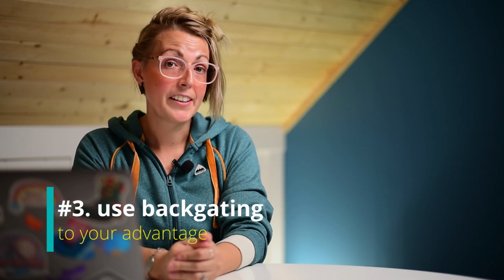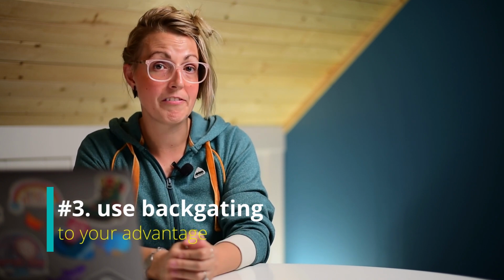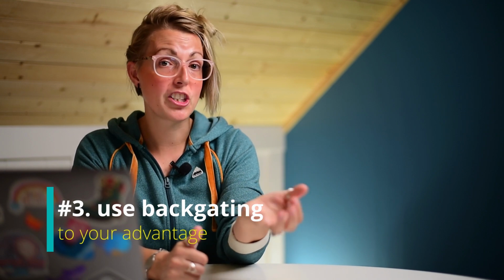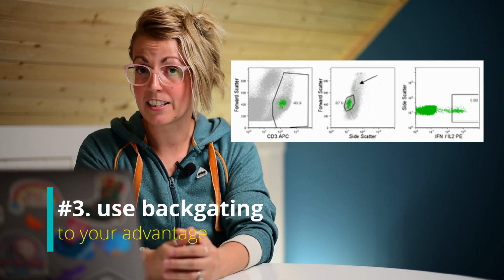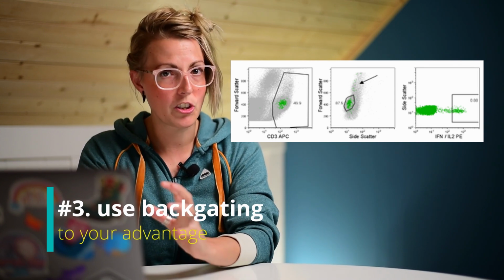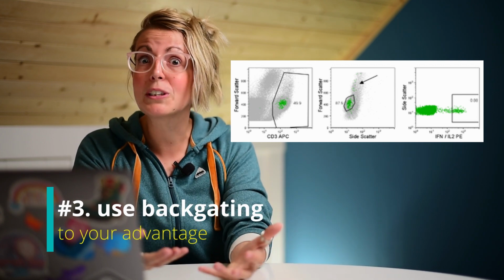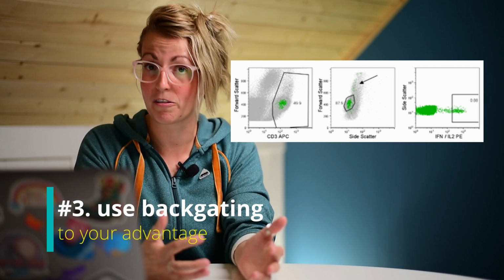Tip number 3, use backgating to your advantage. Backgating is a feature that you can find in FlowJo that will essentially take your population of interest and show where it falls in previous gates. So this will allow you to assess if you've missed any of your cells of interest, but also to show that your cells are showing up where you would expect them to on your previous plots. It's also really great for finding any problems you might have with your reagents or your workflow.